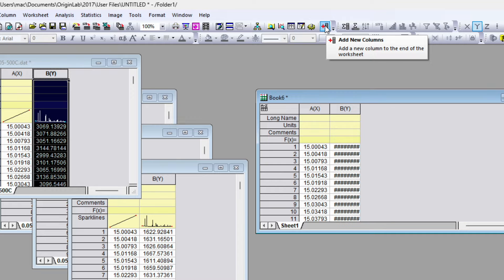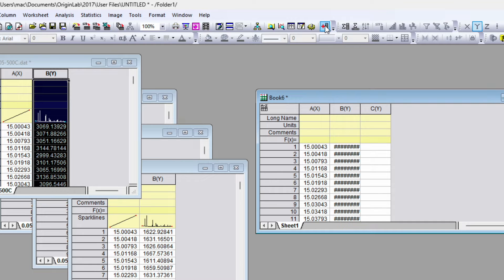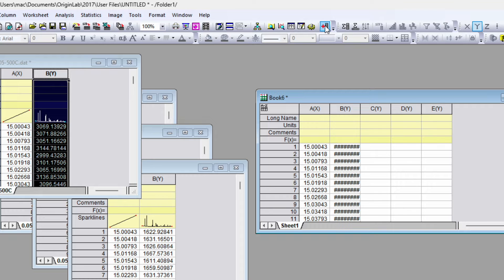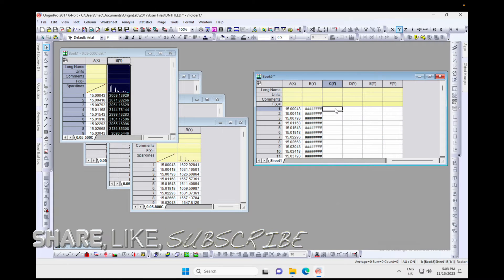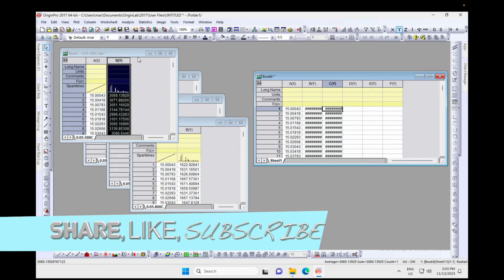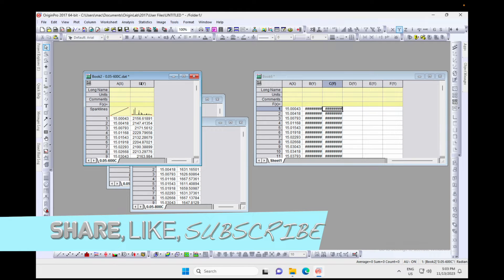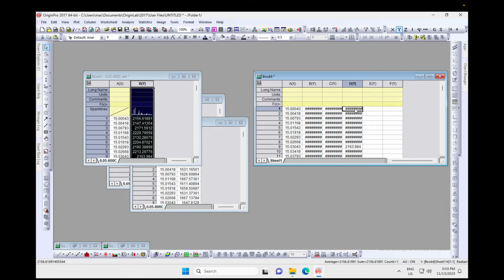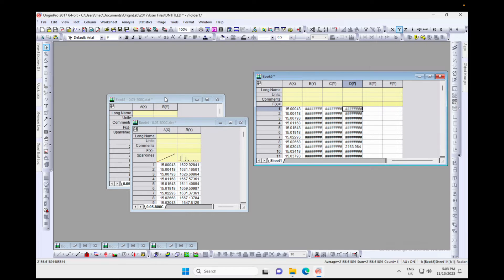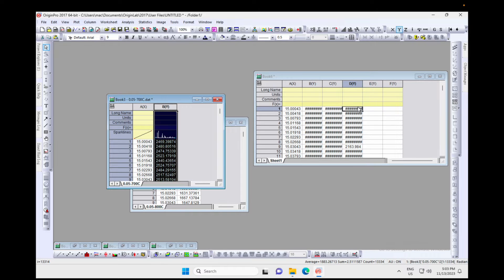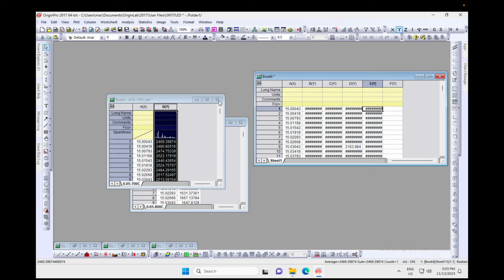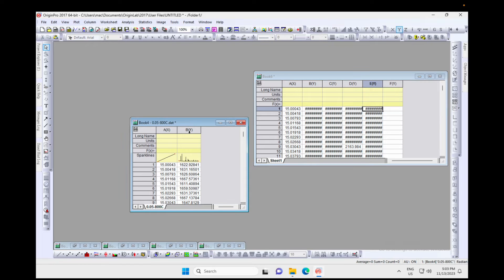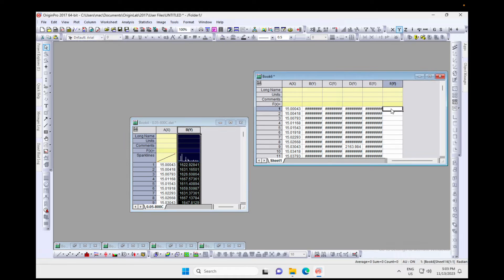I don't need to select the x-axis column since it's the same, so just select the Y column and copy it. Add a new column by clicking here — we need a total of five columns: three, four, and five. Paste the 500°C data, then copy the Y column for 600°C and paste, then 700°C copy and paste, then 800°C copy and paste. That's all.